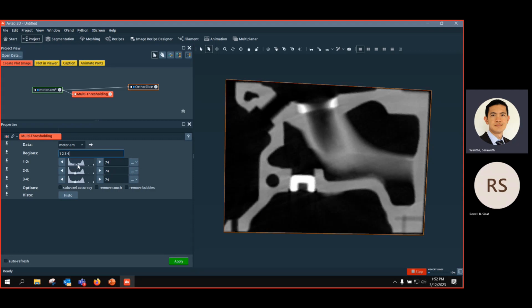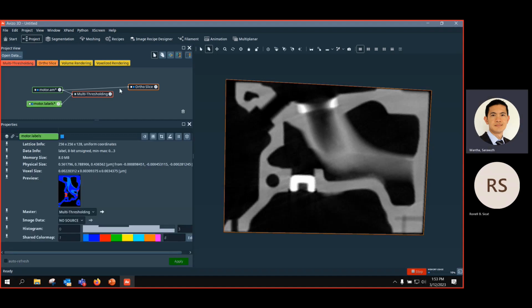So here it's the same as you do with iterative thresholding, maybe 3 times, then you get this kind of 3 materials. So I adjust range 1 to about 35, range 2 maybe 100, and then range 3 maybe somewhere here, 100, 200, 190. Yeah, you can also click apply, then you should get this result.